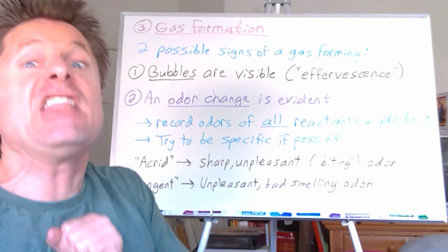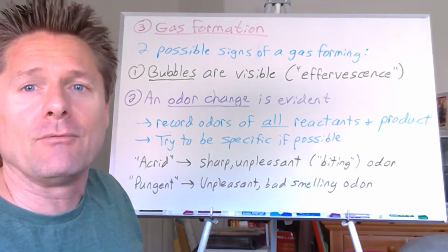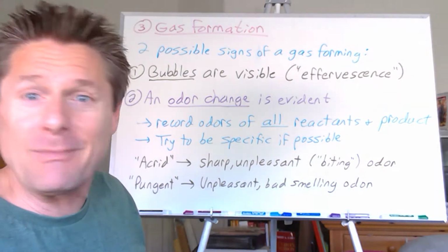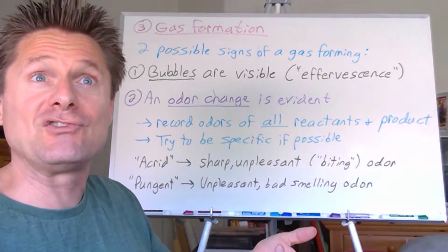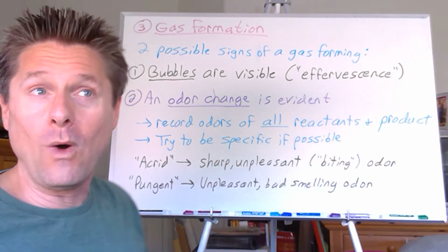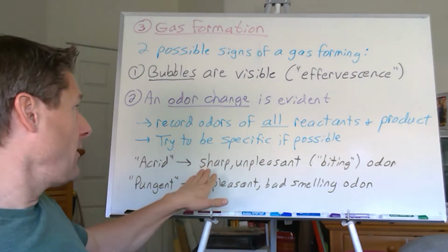Don't just say it smells, or the odor changed. That doesn't tell me anything. The odor change is a conclusion. What made you indicate that, right? All right, so here we go.